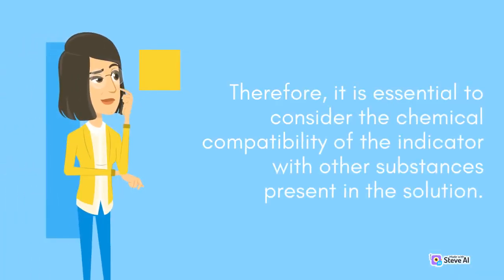Therefore, it is essential to consider the chemical compatibility of the indicator with other substances present in the solution.